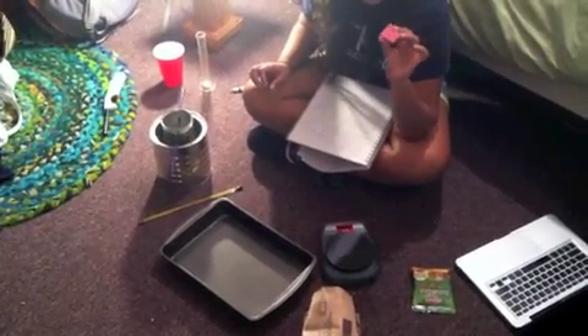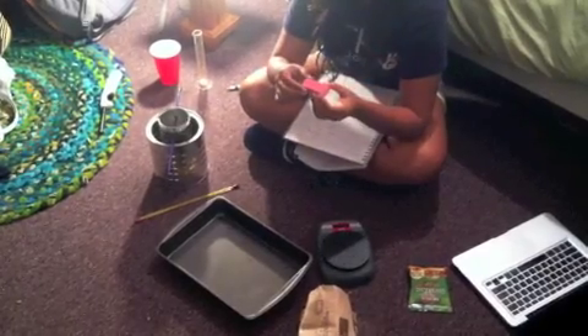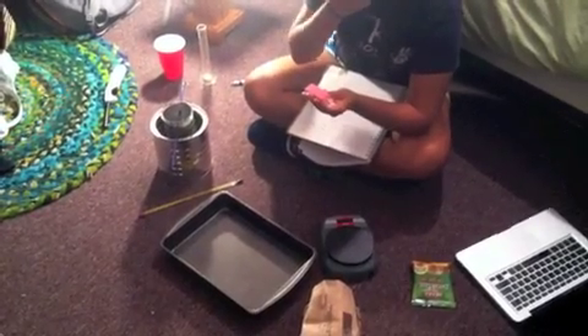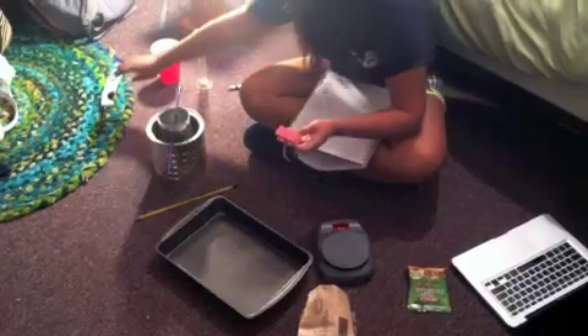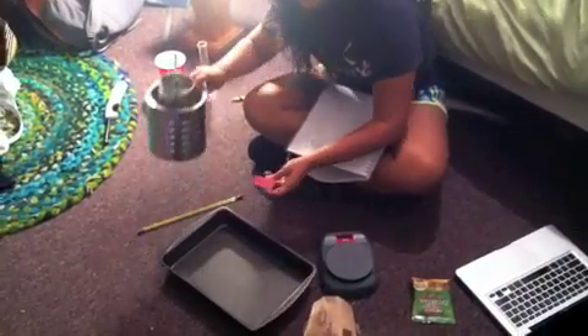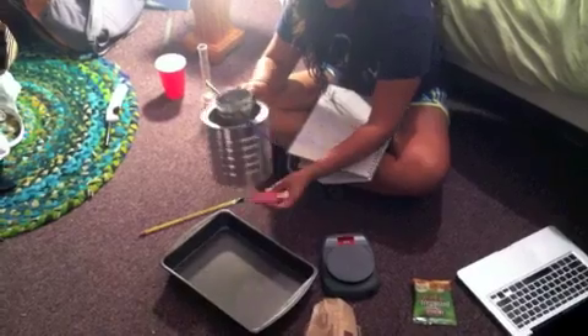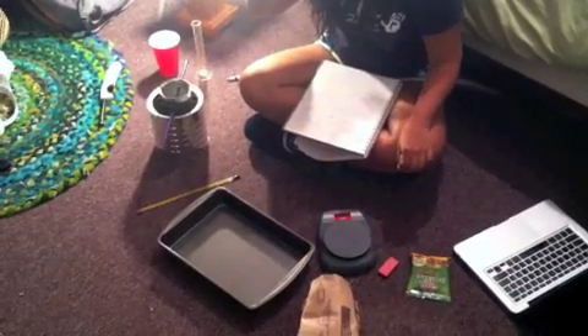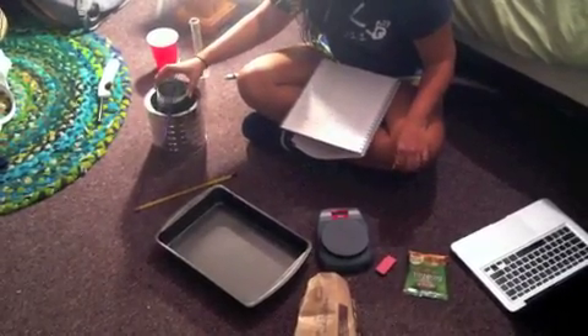It has a needle that I put into an eraser for support, and we'll put the food item on the needle and light it. We'll place it underneath the can and what we're trying to do is capture the heat released from the food.